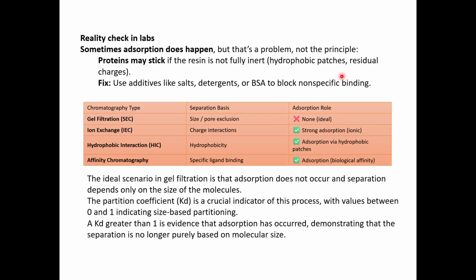So, how to fix it? You can use additives like salts, detergents, or BSA to block the non-specific binding.